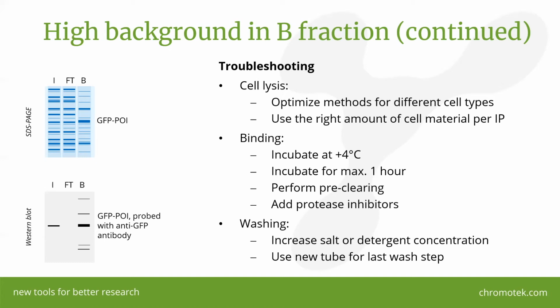Keep the incubation temperature at 4 degrees and short. 1 hour is normally enough, and overnight incubation is not needed. The longer you incubate your sample with the nanotraps, the higher the background will be. Do pre-clearing with naked beads to remove proteins that bind unspecifically to the bead matrix. And finally, you should add protease inhibitors to all buffers, not only lysis buffer, to prevent protein degradation.